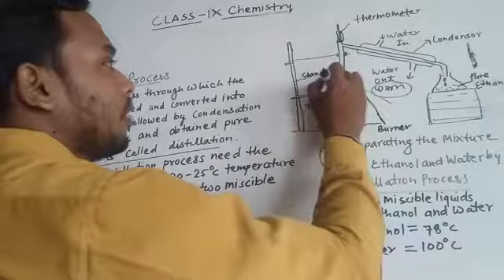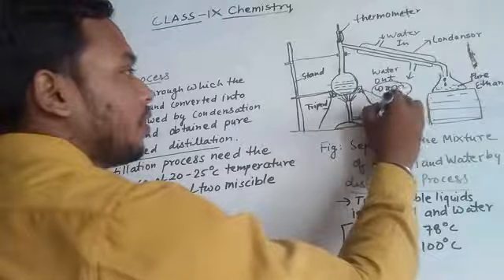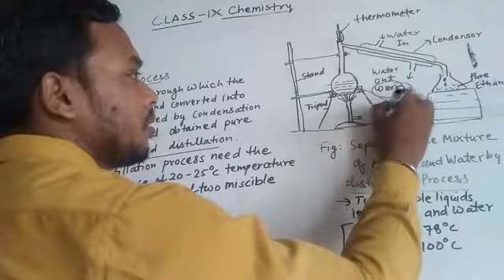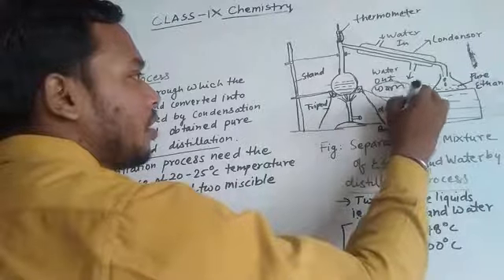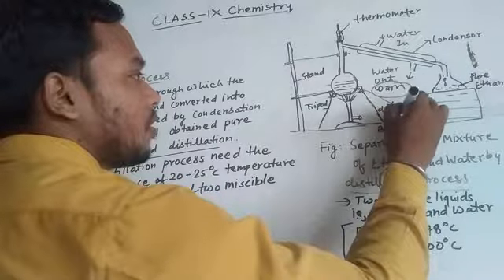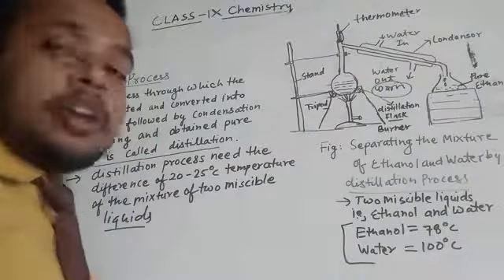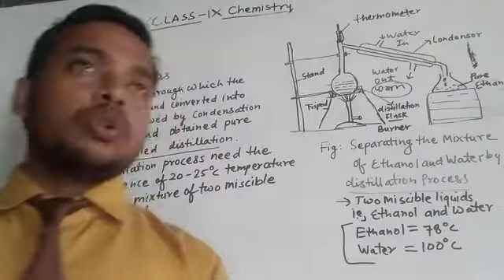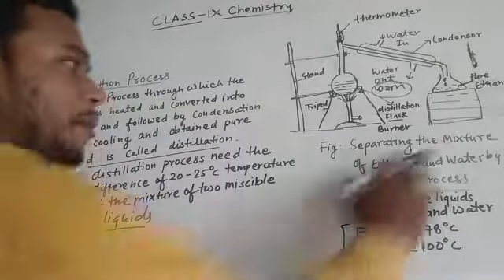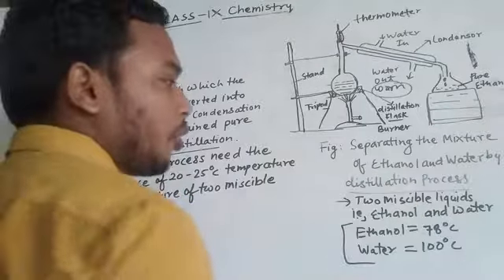It is a distillation flask. So in this way, it is the setup for separating a mixture of ethanol and water by the distillation process.